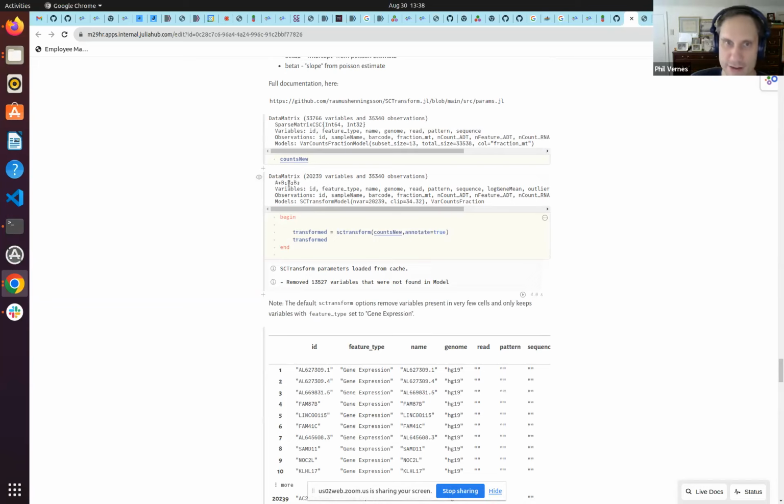So this is going to be using lazy evaluation. This package does not necessarily go ahead and compute this expression, for the simple reason that it's slow. So the package waits until you absolutely need to do it, and then at the moment where you have to make a decision about how to compute this, it will implement a dynamic program.